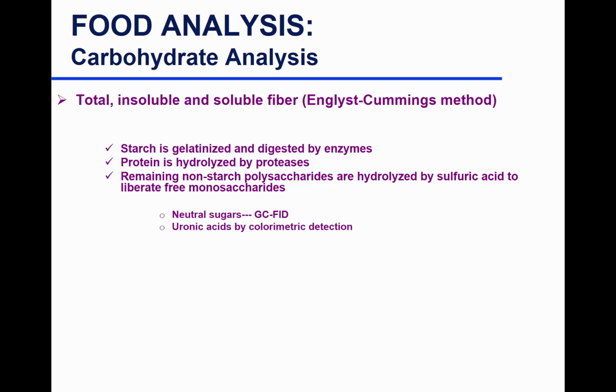The benefit of GC-FID is that it will tell you the monomers that you have, and you can trace it back to whether it is hemicellulose or cellulose. Well, you might not differentiate much between those, but you will differentiate how much pectin you have versus cellulose versus lignin, because, as I told you, the lignin monomers are not glucosides.